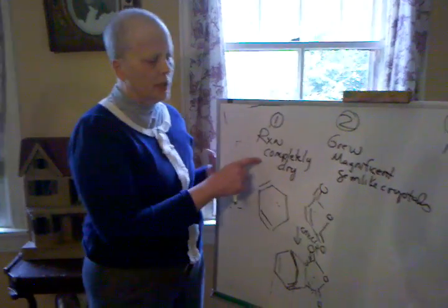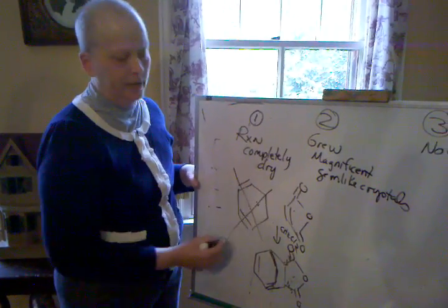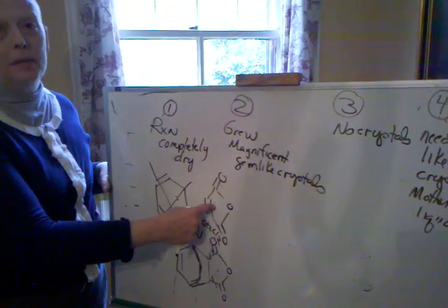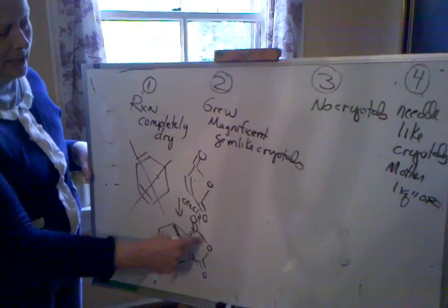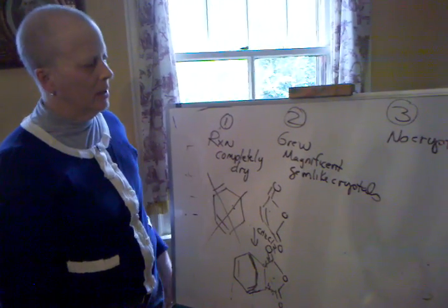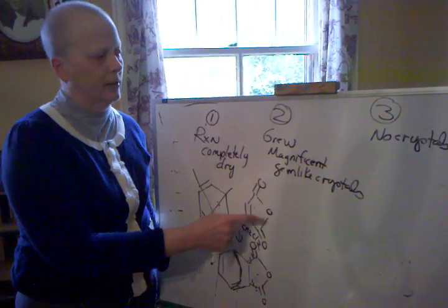Okay? So some of these reactions got completely dry. What that means is this component is gone, the diene's gone. There's probably some maleic anhydride in here, and then this and some of its stereoisomer products, possibly. So the dry ones probably have maleic anhydride in them.